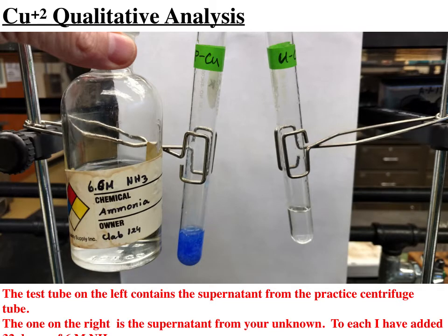Here I show pictures of the test tubes containing the supernatant from our separation of the copper from the lead and the silver. Into each of the tubes, the practice tube on the left, the unknown tube on the right, I added some 6 molar ammonia solution.